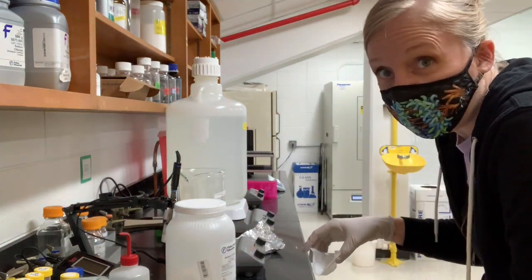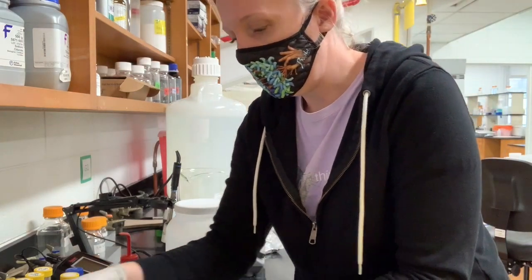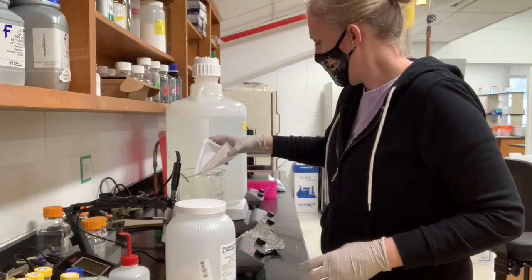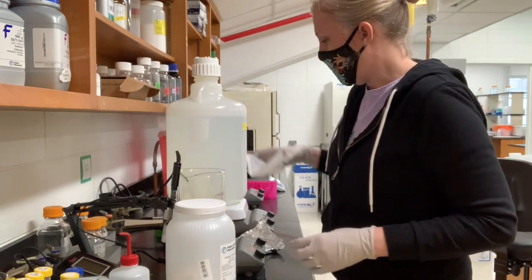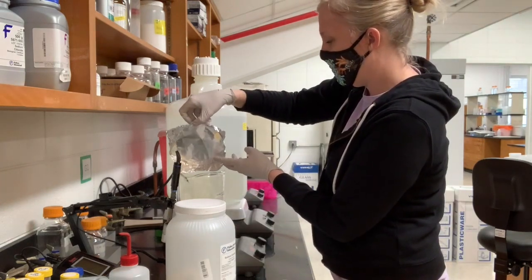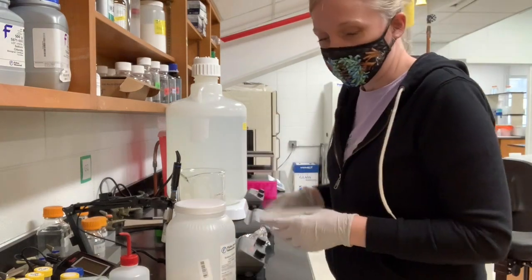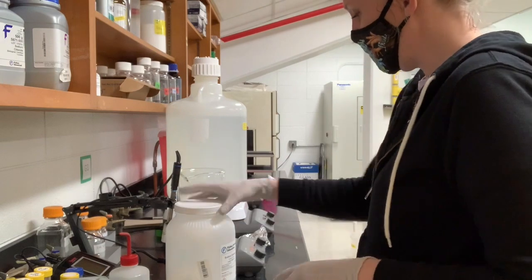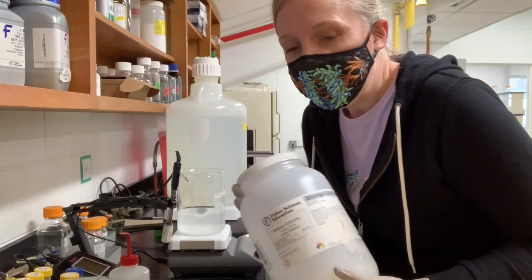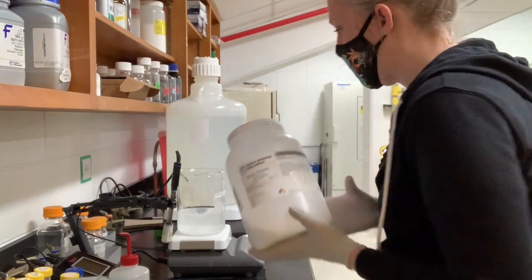And then any extra can just be thrown away. So I have the 80.06 grams of sodium chloride, and I'm going to pour this into my beaker. Because I was looking at you, I got some of it onto the foil that came with it, but you're not going to do that. You're going to get it all in there because you'll be looking where you're going. Every time you use a chemical, make sure that it gets returned to the shelf where it belongs. Some of our chemicals are supposed to stay at cool temperatures, and so those especially need to be handled with care.